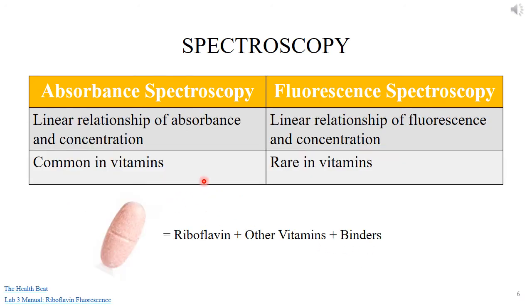Absorbance and concentration are linearly related. Solutions of higher concentration have greater absorbance. Fluorescence and concentration are linearly related. Solutions of higher concentration have greater fluorescence.